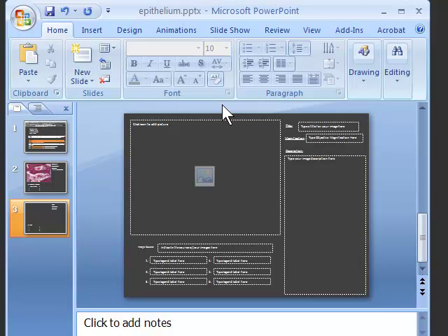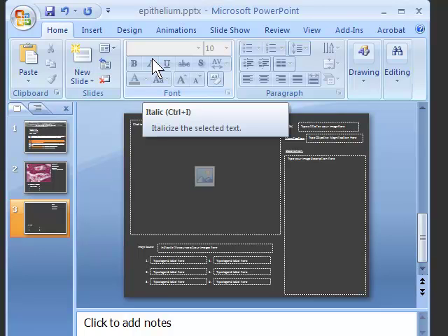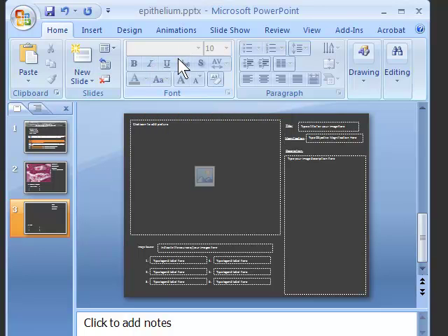I'll give you a list of the images that you're required to take and how many images you're required to take, and you simply insert the images into the eNotebook template. Please be certain to save the file as you go along, as you don't want a crash to have you lose the work that you've done so far.